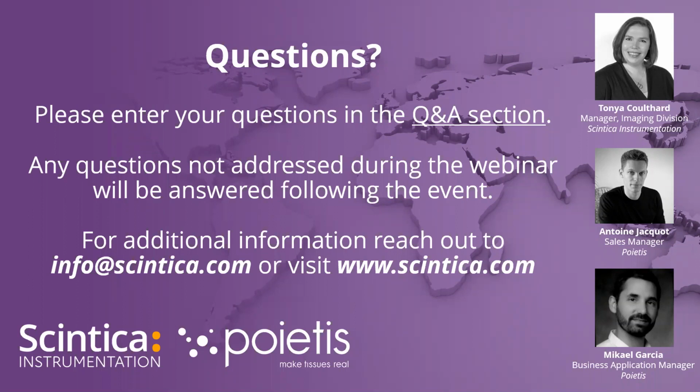Thank you. So far the NGbr system is compatible with single, 6, and 12 well plates only. But we've been discussing with a few people recently who are interested in using 96 well plates with the instrument. So technically, it is possible to use it.